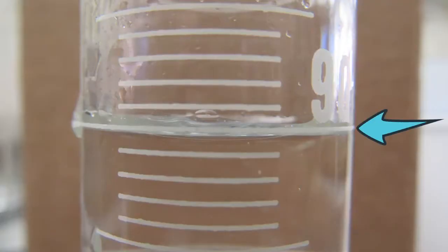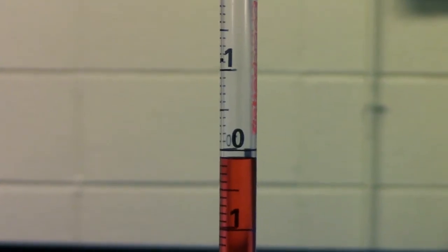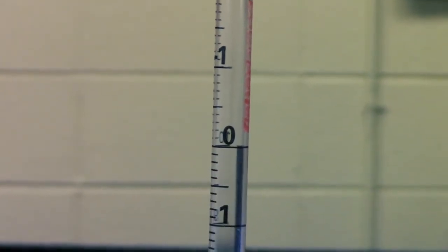The meniscus is this water line right here. When you are measuring the amount of liquid you are taking in, you should start measuring from the smaller numbers closer to the bottom of the pipette. When you are trying to release the liquid from the top, you will have measurements going downward to help you see how much you are moving.